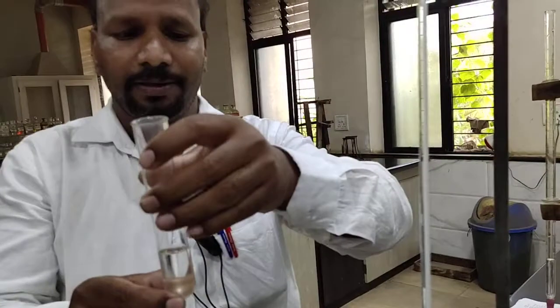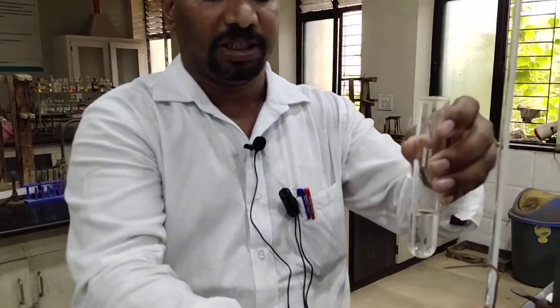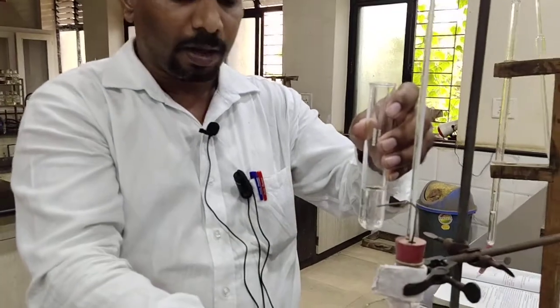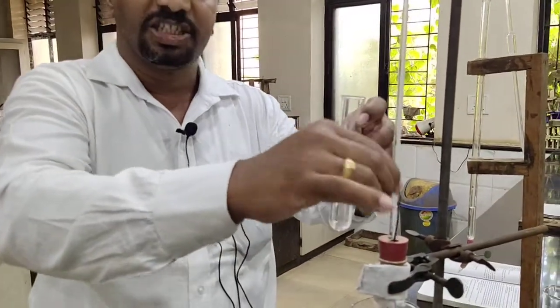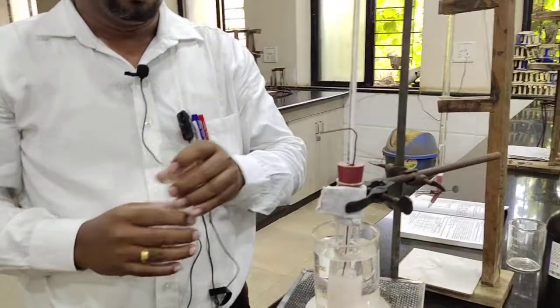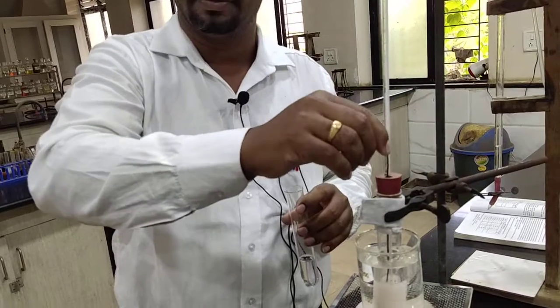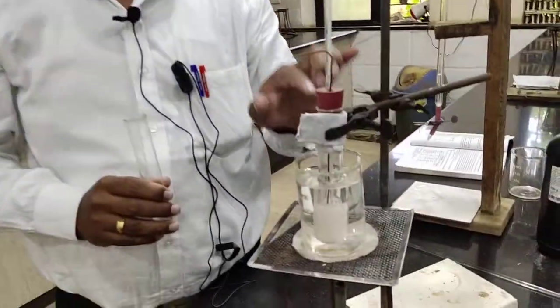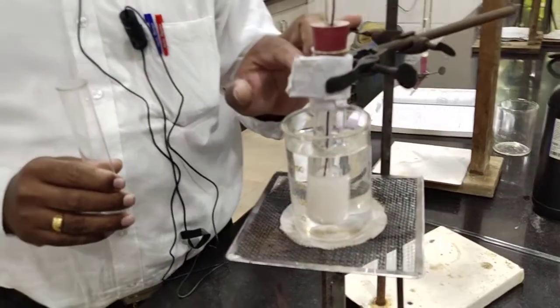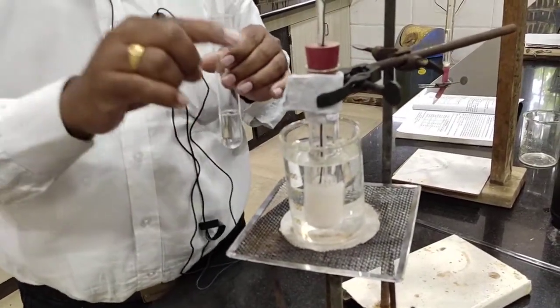Okay, then what we have to do: remove the water bath from here and again stir it, so that we will again get the turbid solution. Now as soon as the solution becomes turbid, we have to measure that temperature as T2, and we have to take the mean of that T1 and T2.